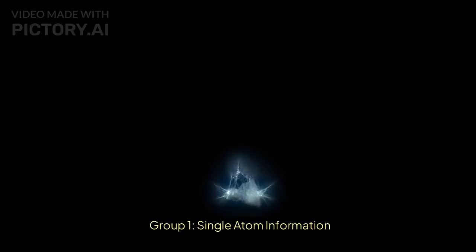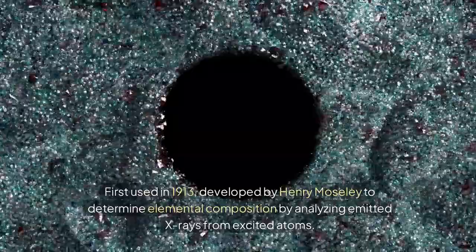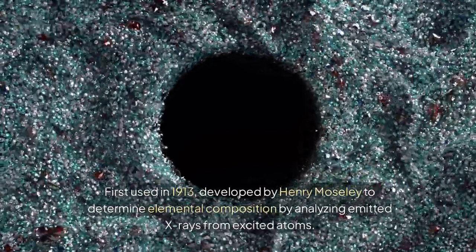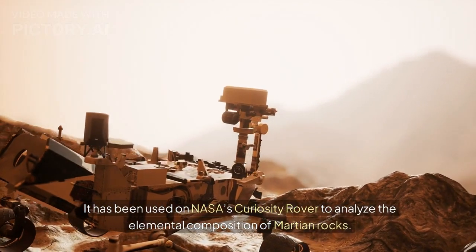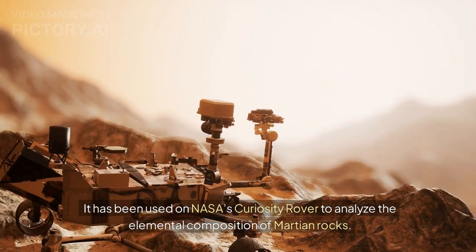Group 1. Single Atom Information. X-ray Fluorescence, XRF, first used in 1913, developed by Henry Moseley to determine elemental composition by analyzing emitted X-rays from excited atoms. Handheld XRF analyzers are available for as low as $5,000. It has been used on NASA's Curiosity rover to analyze the elemental composition of Martian rocks.